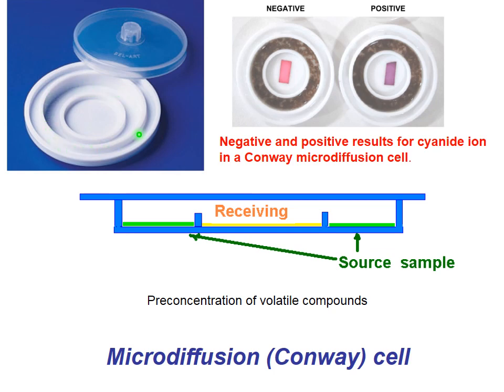So in this area, you are putting your very dirty samples, say blood sample or urine sample, with no purification, and adding some salting out agents. Salts will force volatile compounds out of your aqueous solution.